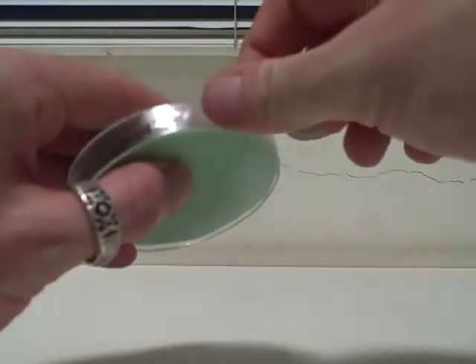The agar works well. It's got food for the bacteria and it's moist. If we leave it sitting here for a few days, it'll dry out, the bacteria will die, you end up with nothing. So your job is to seal the plate well.